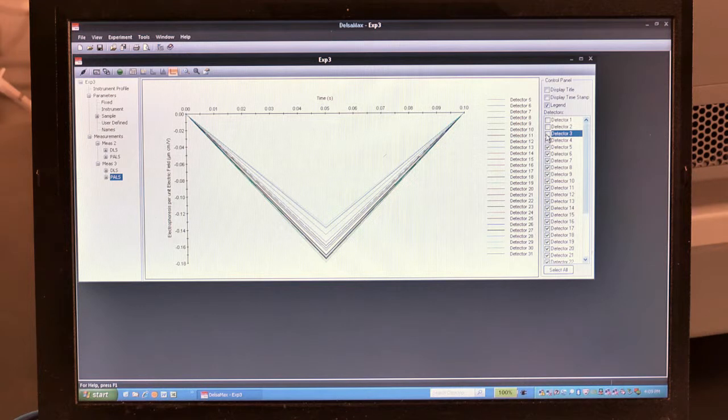And this is due to the larger particles in solution. Those first 4 detectors measure small angles. The larger clumps that we picked up that were about 1 micron in size only scatter light at small angles, so their scattered light is only picked up by the first few detectors.